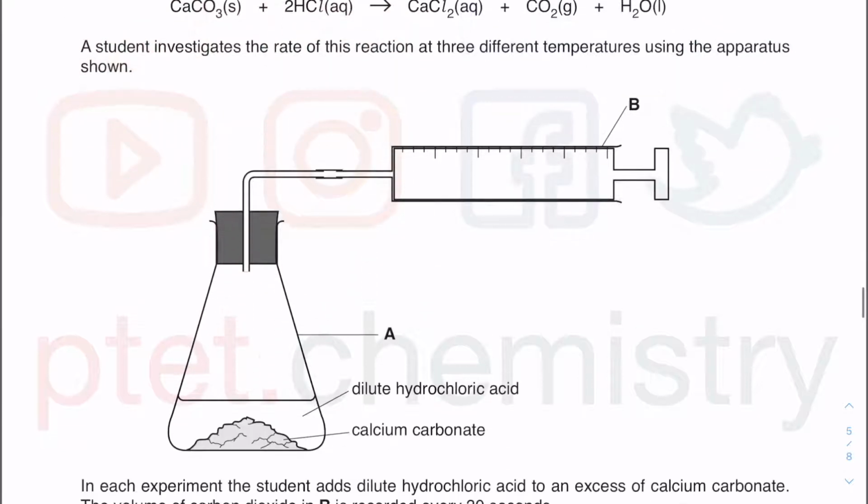Here you're going to investigate the rate of reaction at 3 different temperatures. So this is what is changing. What you change here is not anything else but temperature. So what you change is going to be your x-axis. Your x-axis is going to be your independent variable. So they are on the x-axis, they are on a horizontal scale. They are what you call the independent variable.